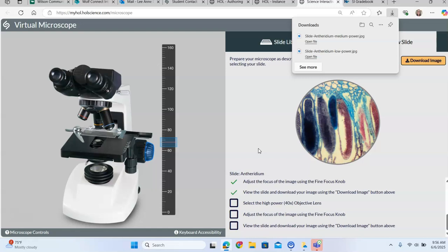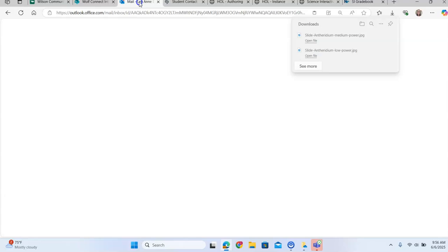And I don't know if this has been helpful to you or not. But I have a feeling just from making the video that you guys went up there and clicked and you didn't see the antheridium slide maybe. Let me go back and look at your pictures.